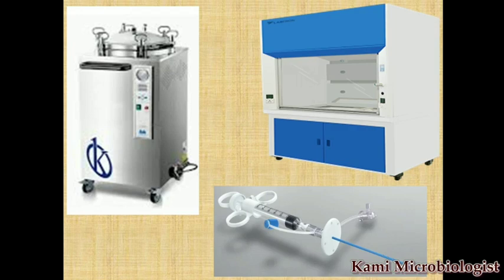This is the LFH, which provides a clean environment, so in the LFH we perform all the culture tests. This is the aspiration needle, or syringe, through which we can take the pleural fluid from the chest area, or the ribs. This is the pleural fluid syringe.